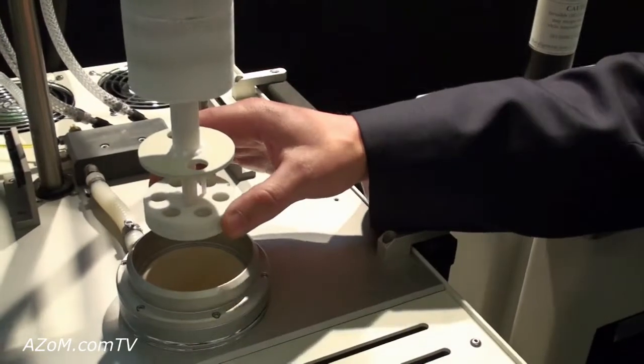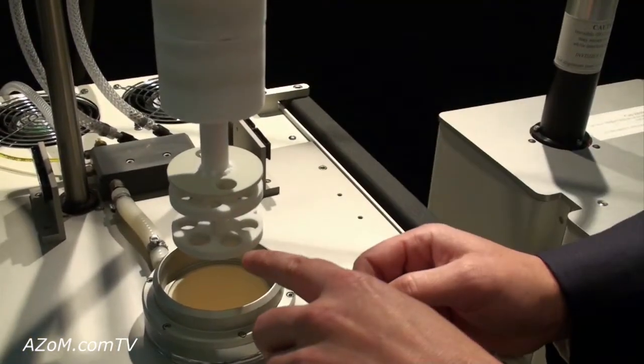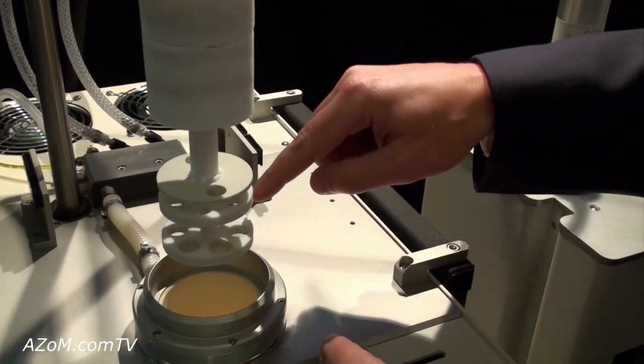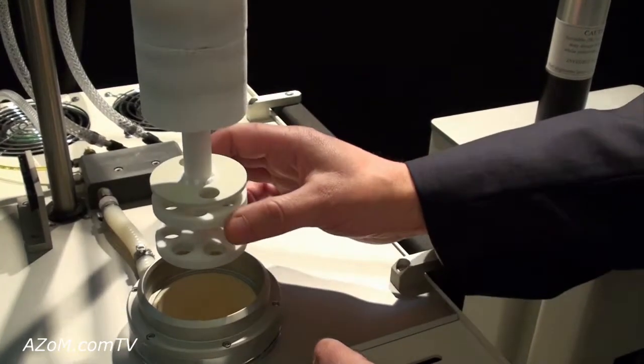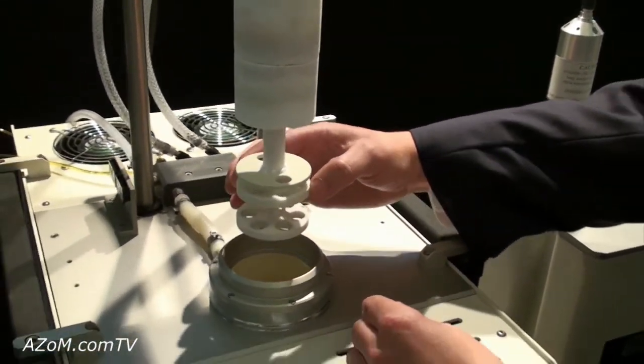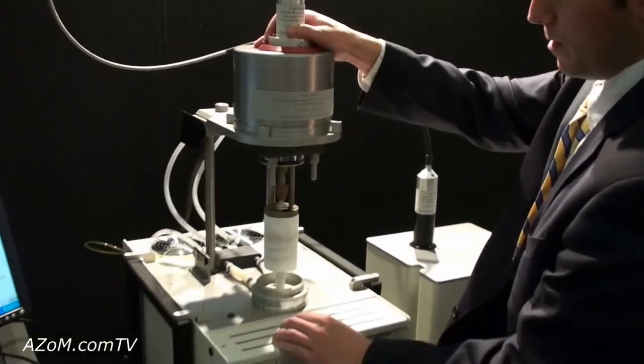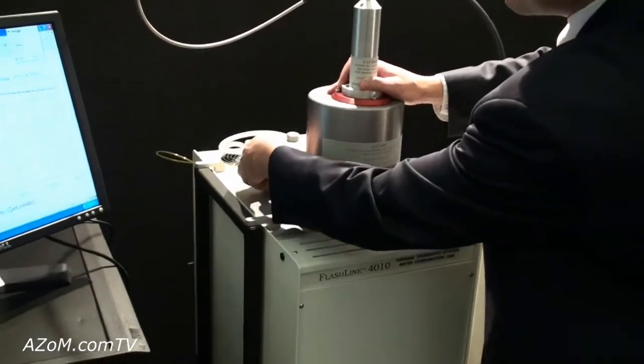Now, it's a simple test. You would take your sample, load it into the carousel. This is a six-sample carousel so you would load five unknown samples and one known reference. You would then close the carousel and you can lower the head into the furnace. Just lock it down.